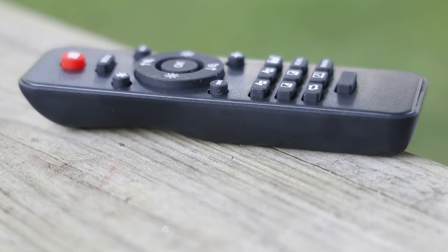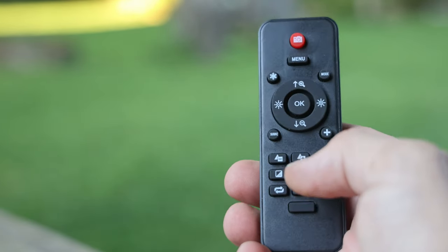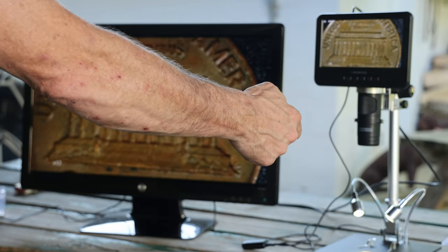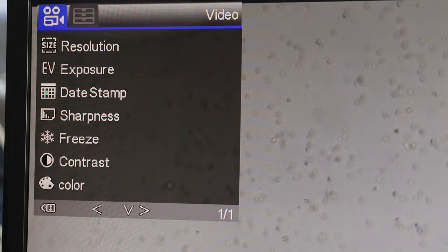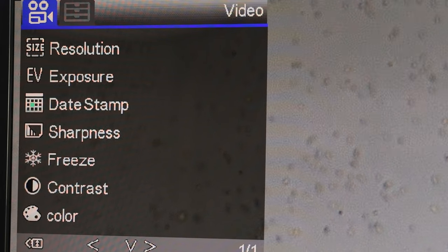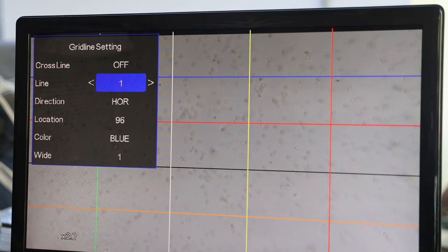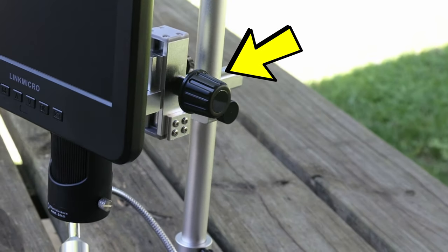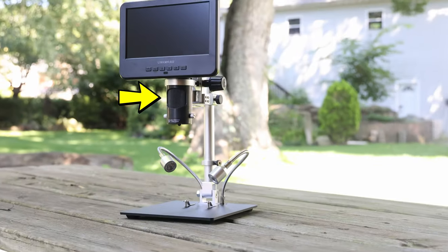There's a wireless remote that you can use to control things such as the camera, brightness of the picture, sharpness, and other things. I noticed that the remote has to be pointed directly at the monitor and relatively close in proximity for it to work. There are many options in the menus for changing the quality or even the color of your picture. There are even options to put crosshairs or grid lines over the screen. There's a rack and pinion on the column for more precise up and down movements on the head, an in and out adjustment, and to focus, there's a large vertical knob in the middle just above the lens.